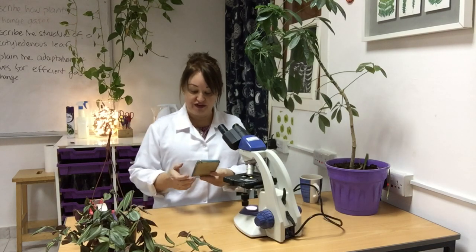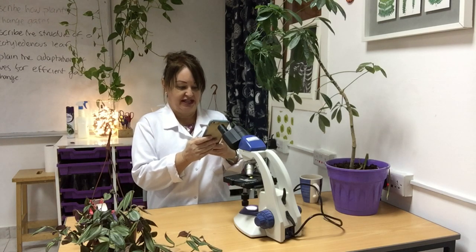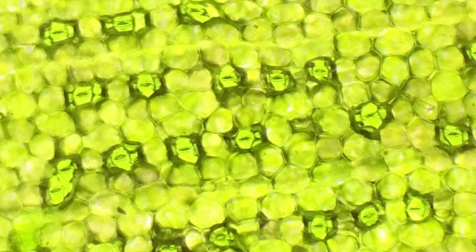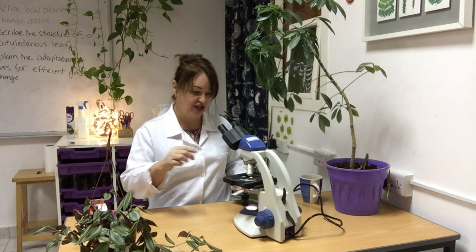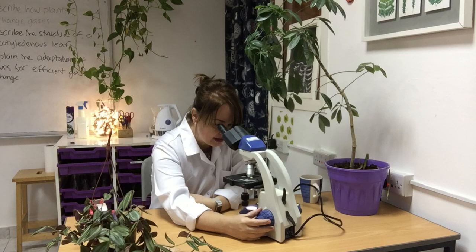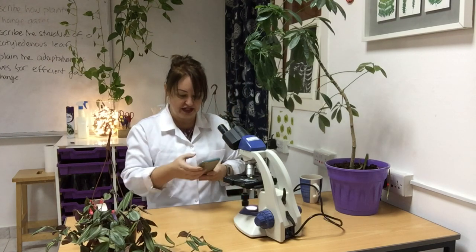I'm going to take a photograph of that with my phone — very easy to do, takes a little bit of practice. Keep your elbows in to stop the wobble. Now I'm going to move on to a higher magnification: wind it away, change the lens, wind it up and have a look. Even nicer — those stomata are coming into really clear focus.